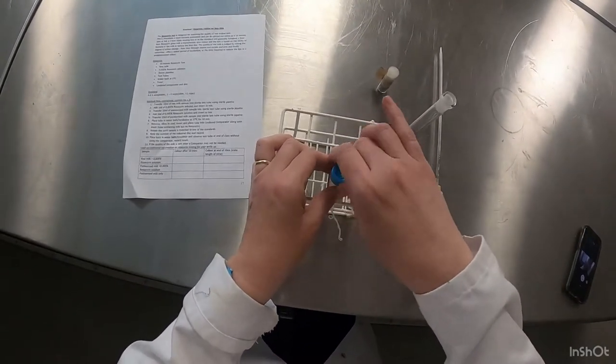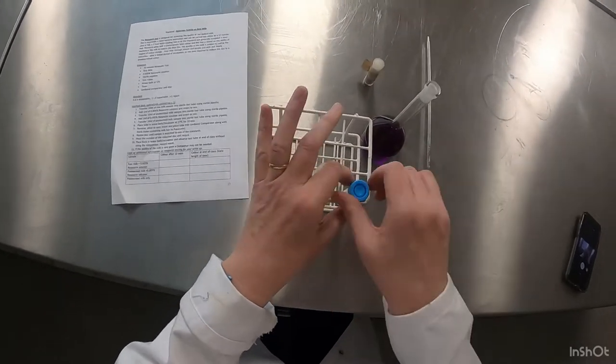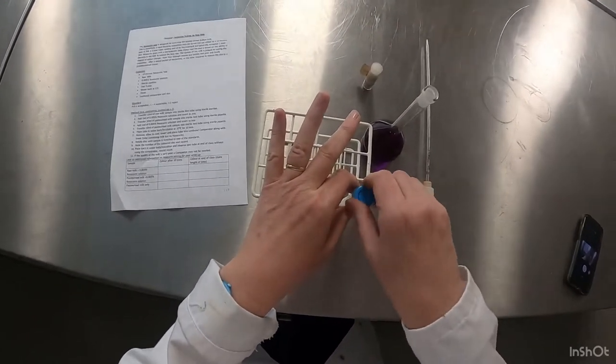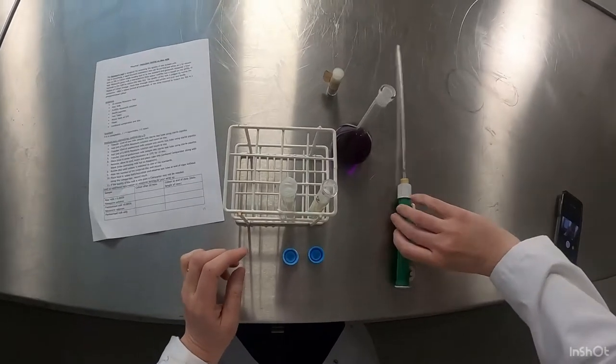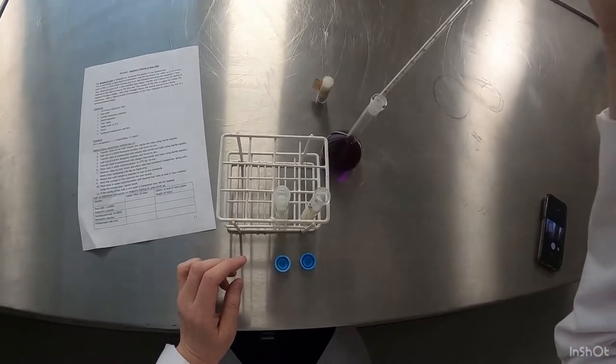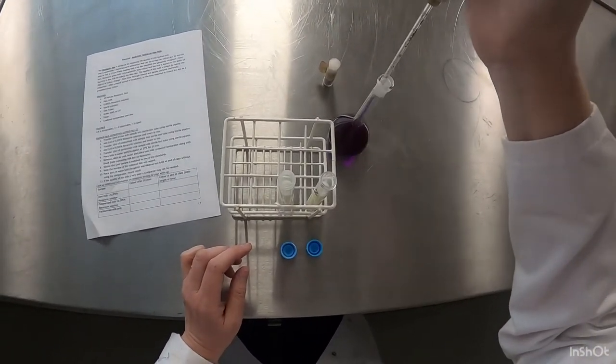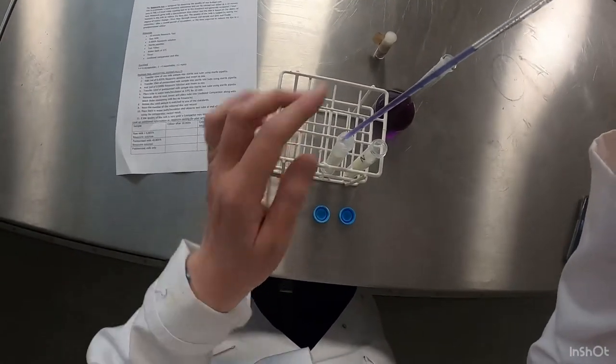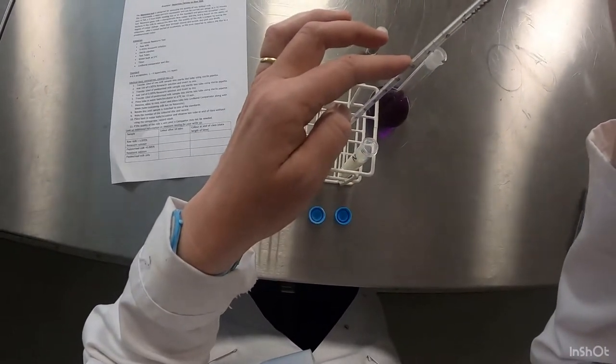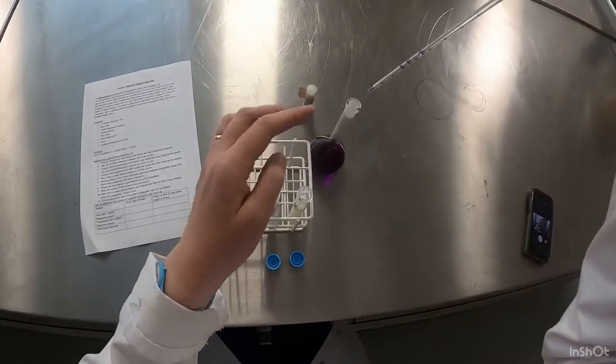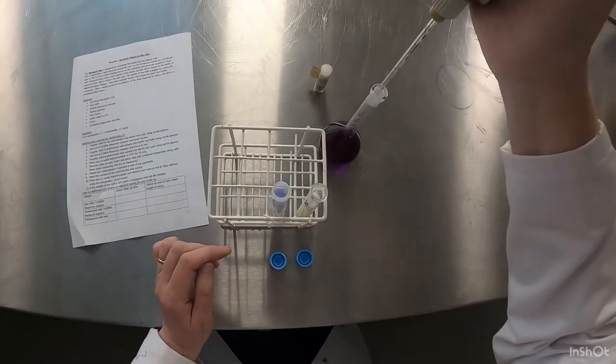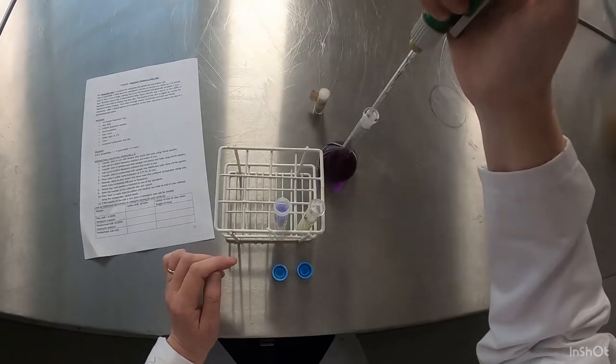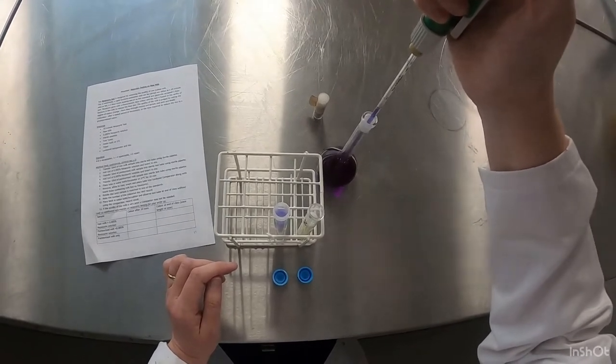I'm going to take the lid off both samples and add 1ml of the Resazurin into each of the samples. One of the samples is raw milk and one of the samples is pasteurized milk. So one is control and the other is the test sample.